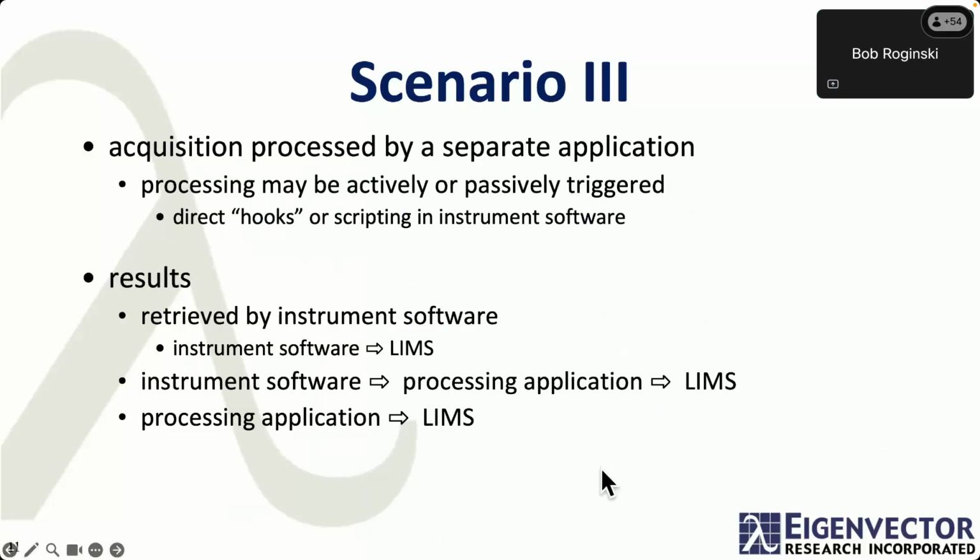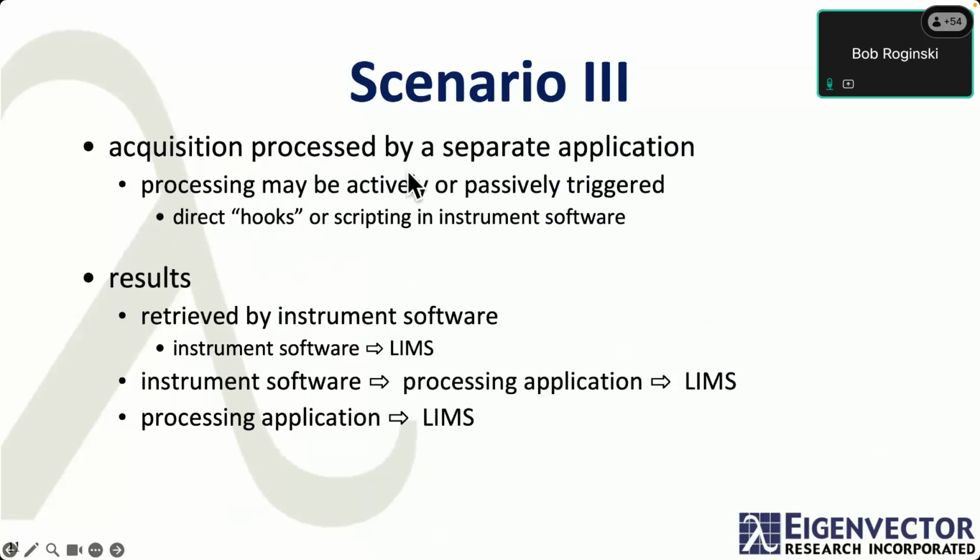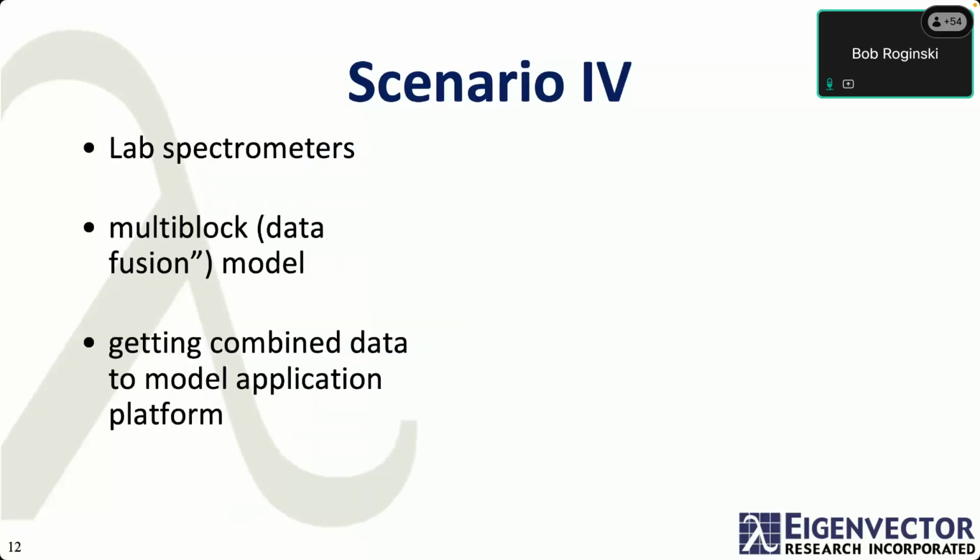And that's summarized here. The acquisition is processed by a separate application. There may be direct hooks or scripting. And then depending upon the linkage between the instrument software and the separate application, you have different means of getting your results ultimately into the LIMS. Okay.